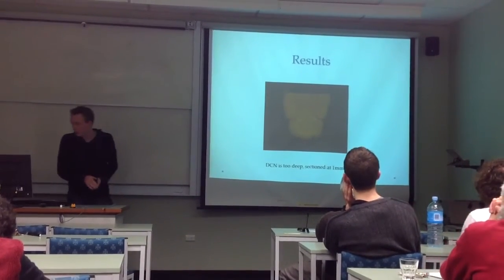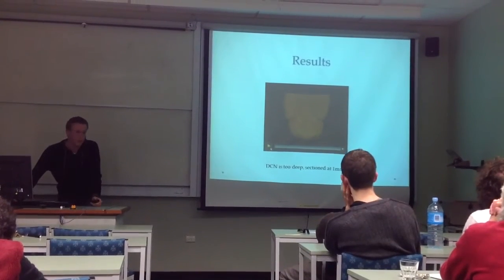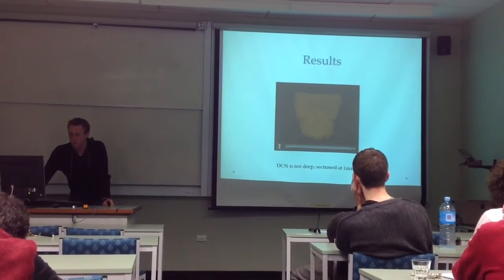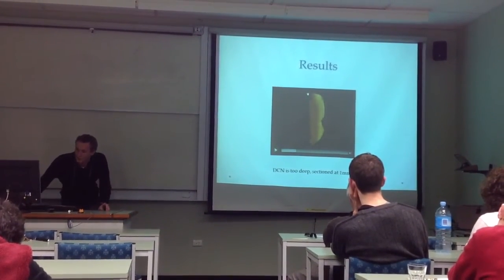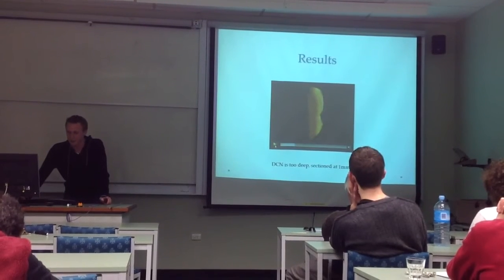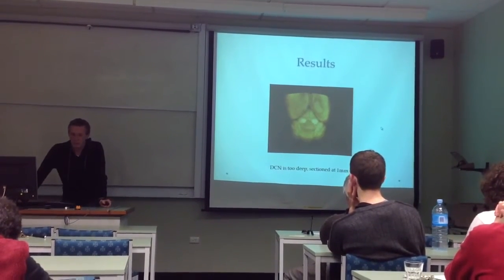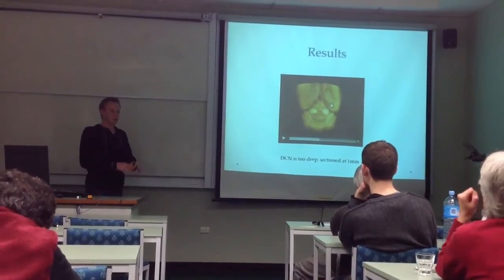This is my initial results for determining whether we can actually just straight up see the deep cerebellar nuclei without any further processing. And as you can see, well, as I can tell you, there's only about 1 millimeter worth of penetration here, and we now know that the deep cerebellar nuclei are much deeper than that. But what you can see, there's a lot of structural information just off the bat. The way of displaying the information here only gives you the surface.